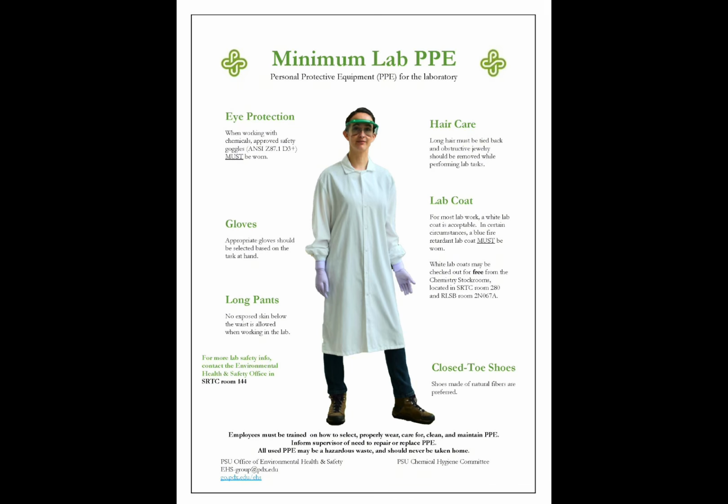Before you touch any lab equipment, it is important to make sure that you are wearing appropriate lab attire, such as having tied up hair and goggles and gloves.